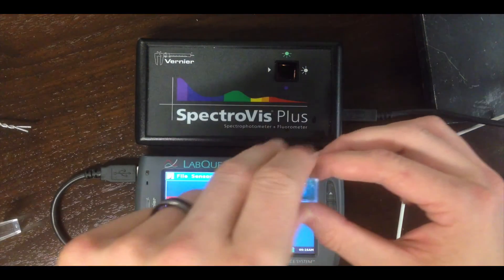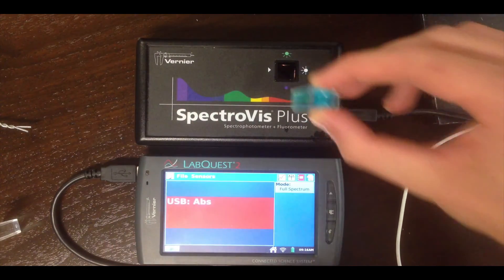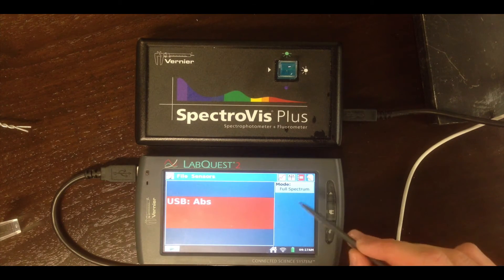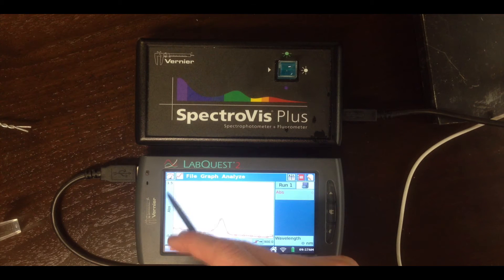I have a solution here of PowerAid. PowerAid is blue, as you can see. I'm going to put it in so that the clear, completely transparent side is in the path of the light beam, not the grooved side. Once calibrated, all I have to do is hit Play — either on the LabQuest screen or by pressing the physical Play button. In full spectrum mode, you'll see on the x-axis a wavelength scale from about 380 nanometers in the violet region up to about 900, which is slightly into the infrared. On the y-axis, you'll see an absorbance scale running from about 0 to about 1.5.